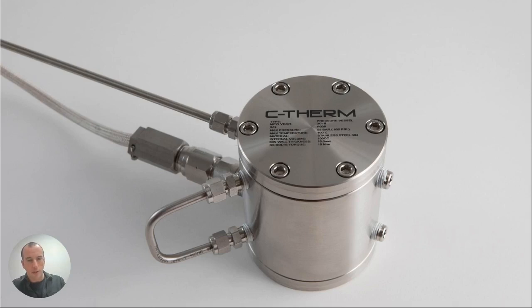Testing at elevated pressure conditions is really important to understanding the effective thermal properties for a given application. When you think about what impacts thermal conductivities, temperature, pressure, humidity, all have a significant impact on the effective thermal conductivity. And what we really try to get people thinking about is to ask yourself the question, why am I measuring this thermal property in the first place?